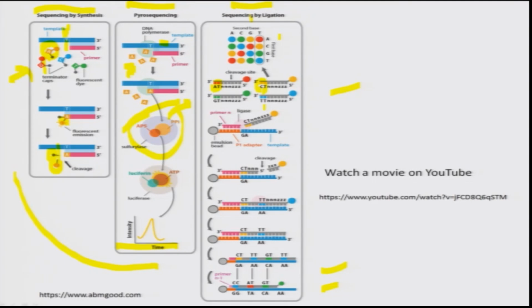Now, for example, you have a primer that is aligned to your sequence, which is single stranded. Since the primer ends here, you have to have a small oligonucleotide that is complementary to the first two nucleotides of your template. If it is GA, you should have the CT containing oligonucleotide that can come and anneal. Once it anneals, the ligation reaction happens and this is sealed to make a larger fragment, right. Because this is annealed and gives you a different fluorochrome, the system is able to call that the next two bases after the primer are C and T.